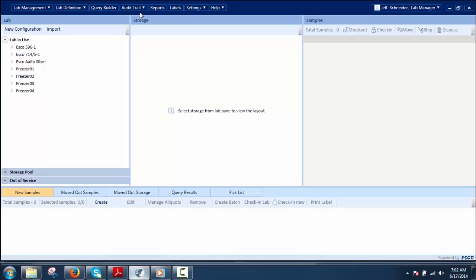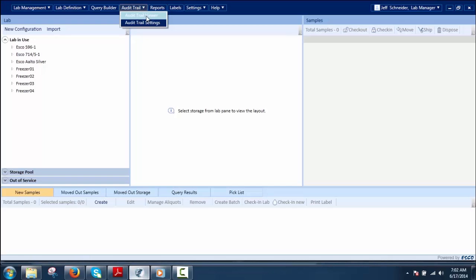Sample Tracker has complete audit trail capability with 21 CFR Part 11 compliance. Audit Trail is a plugin to keep track of activities performed in the Sample Tracker by recording actions and storing this information in the form of history. It also records the full content of actions and allows access at any time based on privileges. Audit Trail has two submenus: Audit Trail Viewer and Audit Trail Settings.